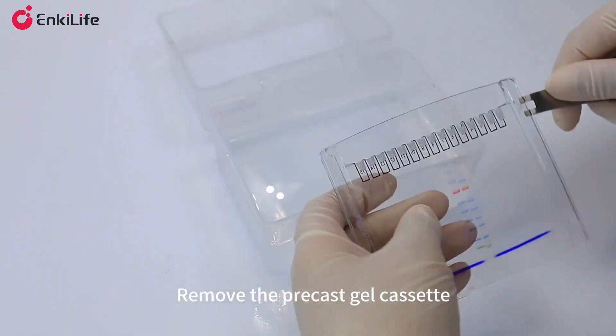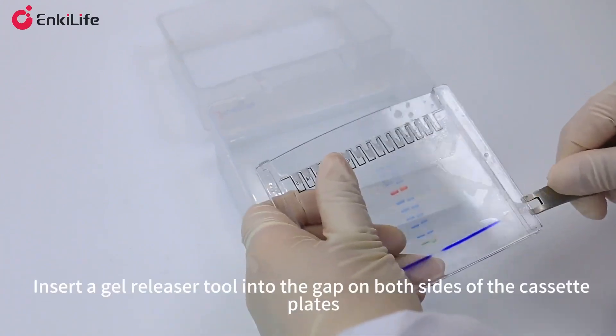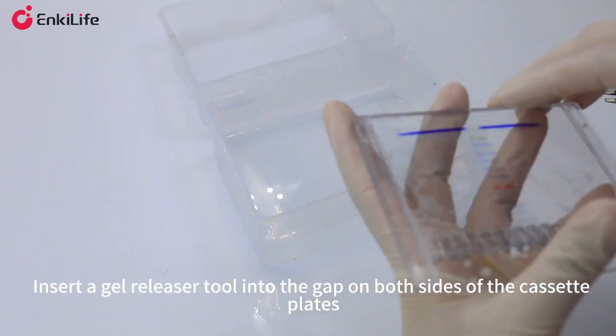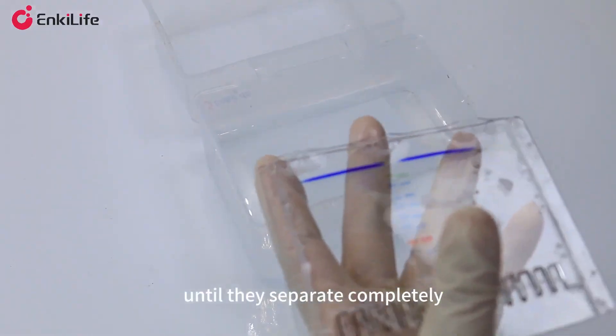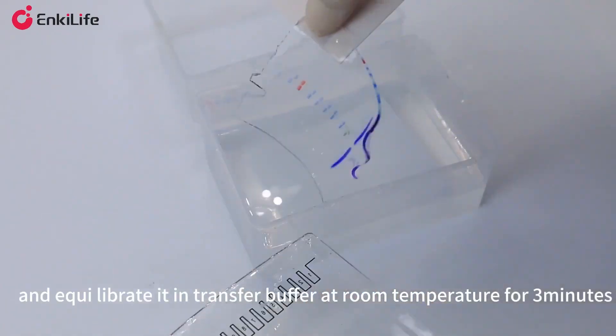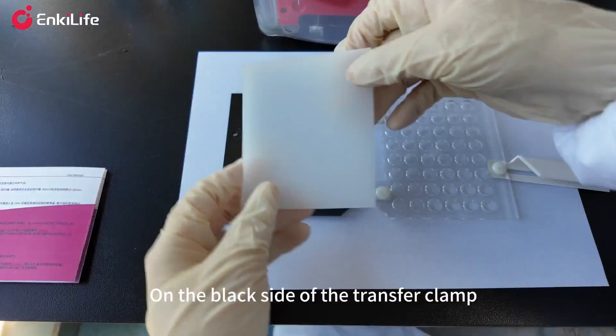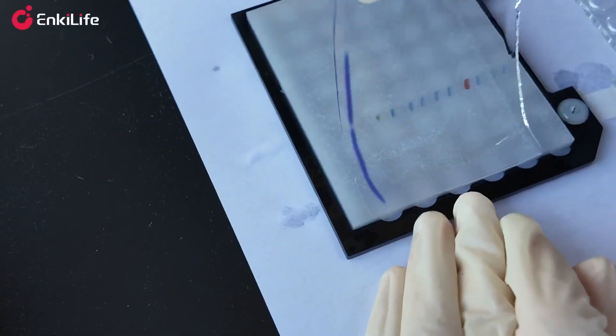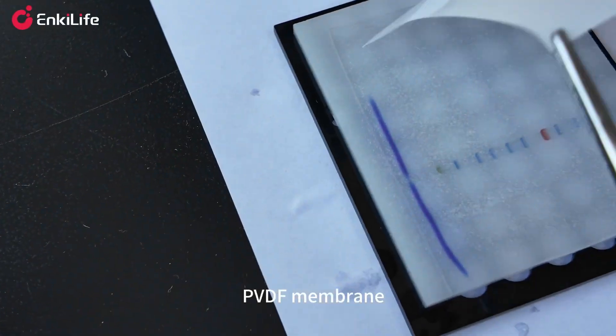Remove the precast gel cassette; insert a gel releaser tool into the gap on both sides of the cassette plates until they separate completely. Carefully remove the gel and equilibrate it in transfer buffer at room temperature for three minutes. On the black side of the transfer clamp, assemble in the following order: sponge pad, precast gel, PVDF membrane, sponge pad.